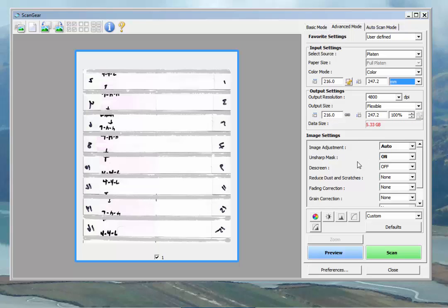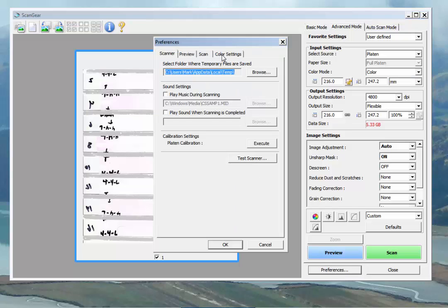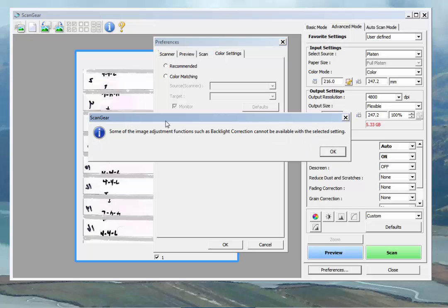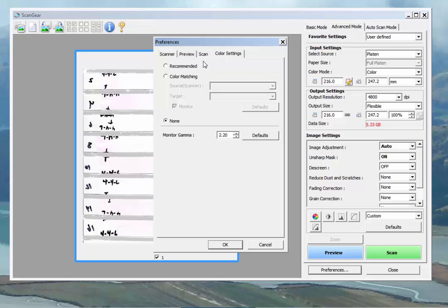Image adjustment, unsharp mask, D-screen, reduce it. Let's avoid those for the moment. And we're going to go right down to preferences. We'll go over to color settings and we're going to click, rather than the recommended color settings, we're going to go to none. Which will tell us that it's going to turn off a lot of its adjustment functions. That's what we want. We don't want the software making decisions to adjust our color. We want the straight color right from the scanner.